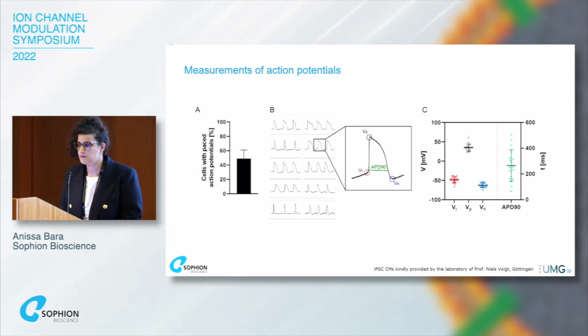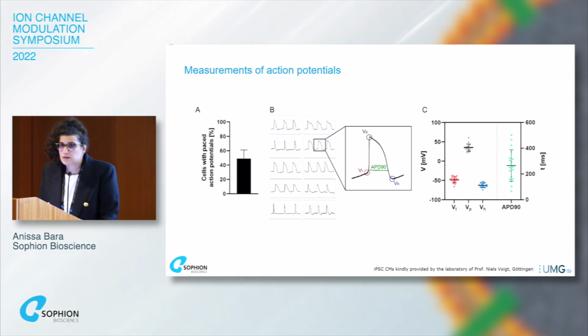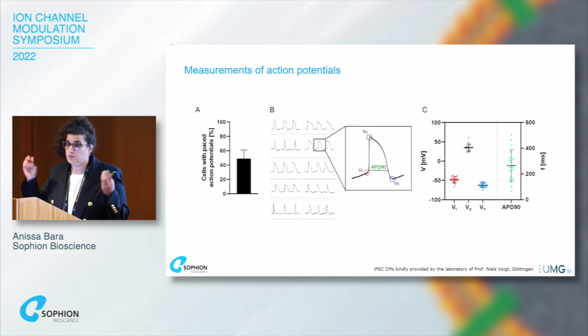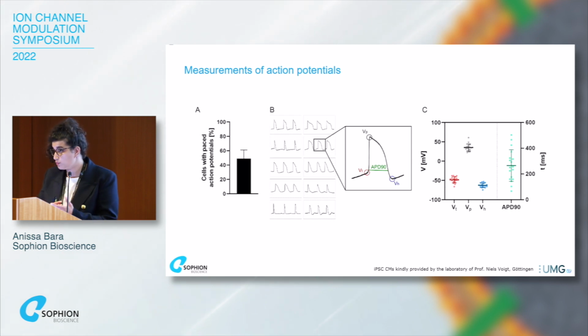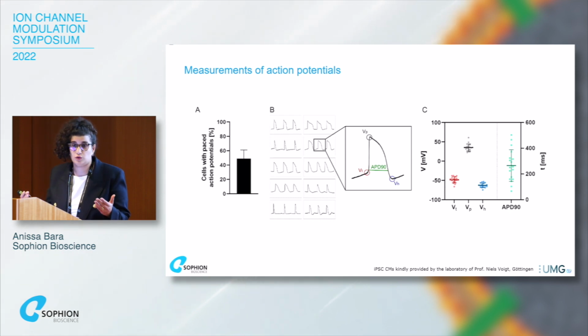So we can face this challenge by playing on the maturity of the cells and maybe prolonging the maturation of the cells in our maturation process. But of course, it comes with other challenges, like we expose the cells to a higher risk of contamination or mutation of the cells.